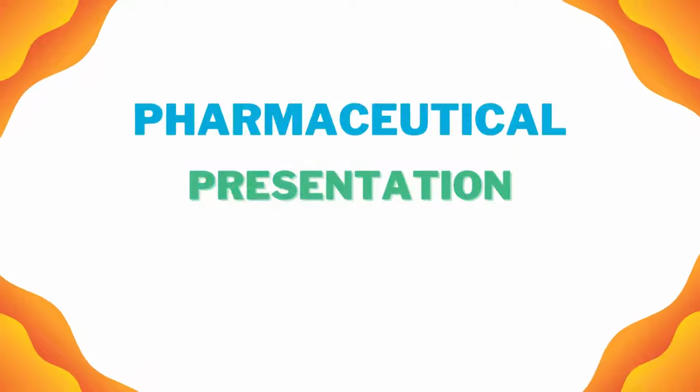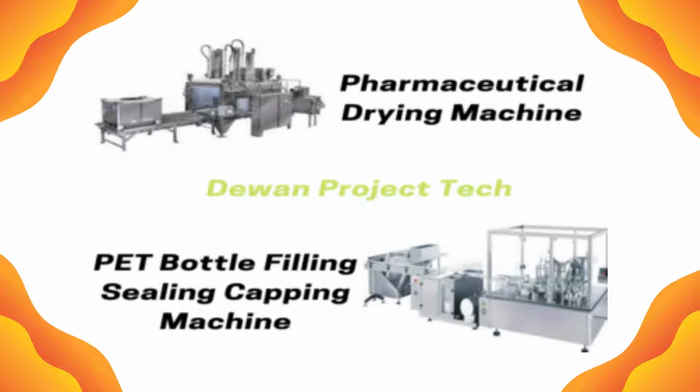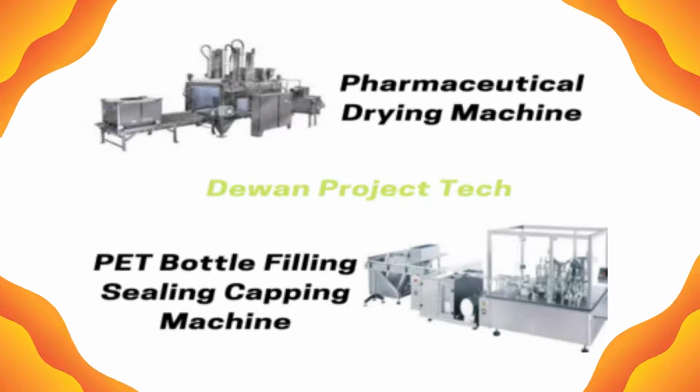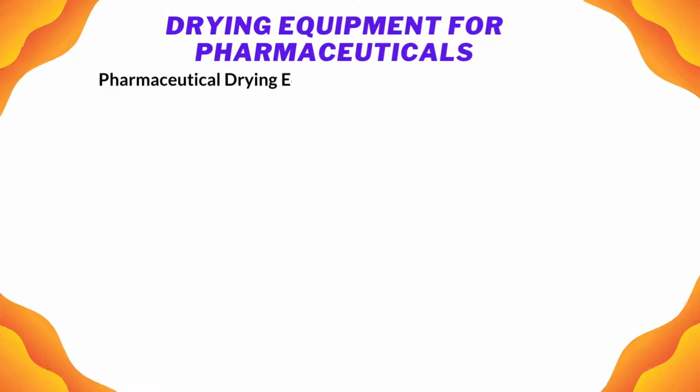Pharmaceutical presentation. Pharmaceuticals drying machine, and PET bottle filling sealing and capping machine. Pharmaceuticals drying machine. Drying equipment for pharmaceuticals.